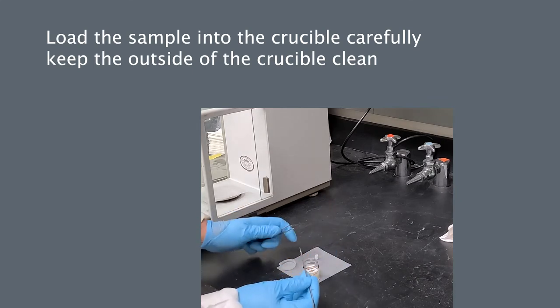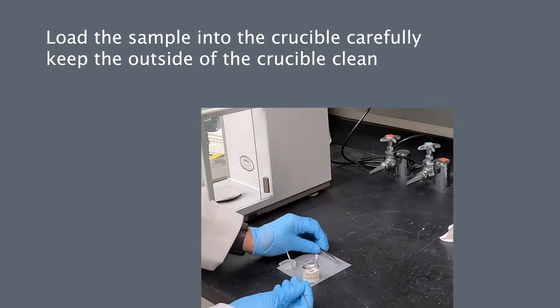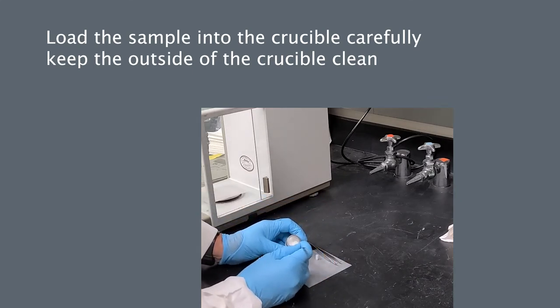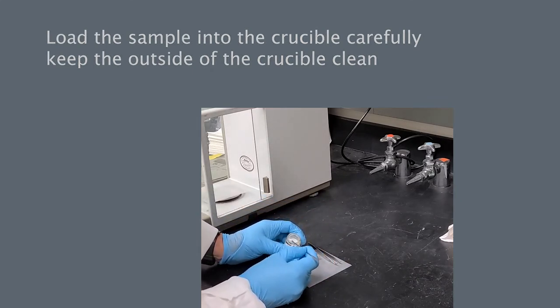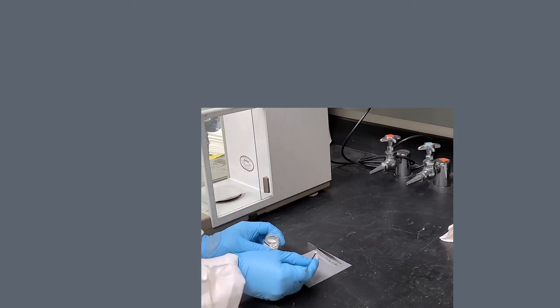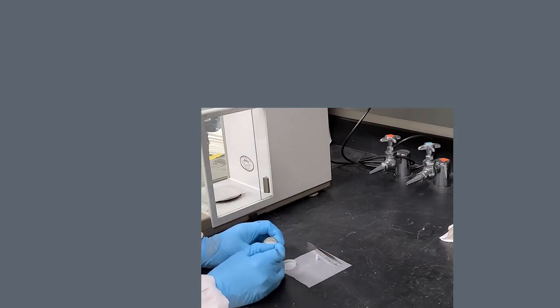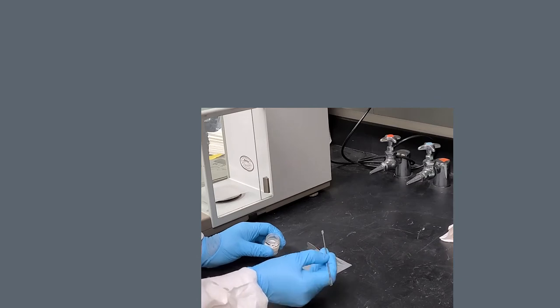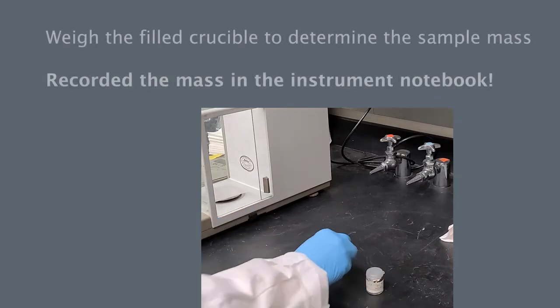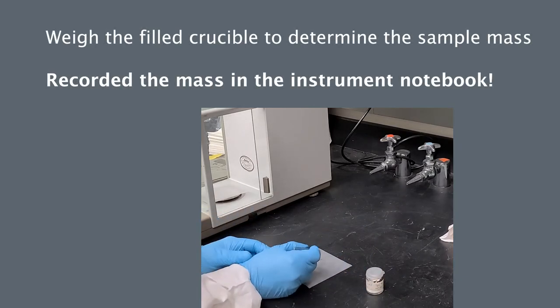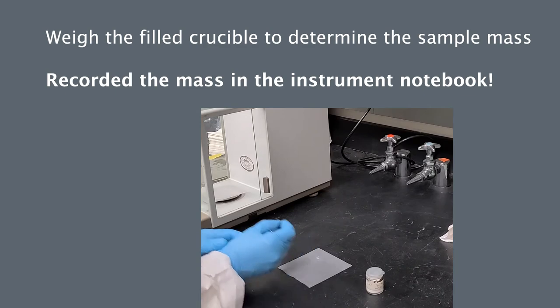Load the sample carefully using a small spatula, then weigh the loaded crucible to determine the sample mass.